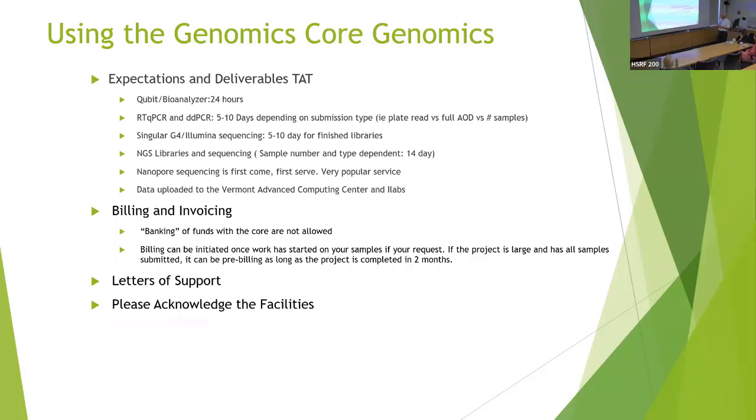So if you're doing nanopore sequencing, this is first come, first serve. We try to go as fast as we can, but it is our most popular sequencing service right now, and we have a lot of them going on at the same time. So keep that in mind. All that data for next-gen sequencing and nanopore is uploaded to the Advanced Computing Center. And I can tell you, uploading some of this data from nanopore can take a day.